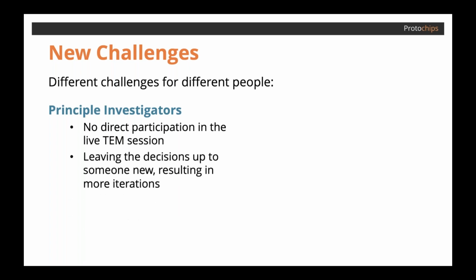And if the researcher cannot participate properly, decisions may be left up to the TEM operator, who might not have as much familiarity with the sample or the experiment or the desires for the experiment. And this leads to more iterative experiments to capture what's desired. And then, of course, transferring the data, like I was just talking about, is a pretty huge hurdle for many.